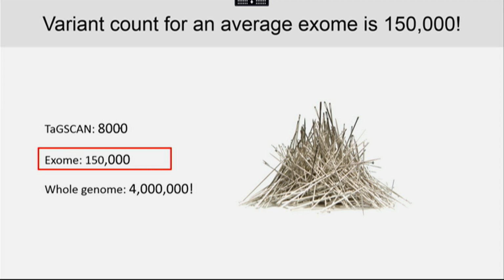If you're fortunate to get parental samples, that helps a lot with the analysis. I was going through our database trying to pick a couple of trios to walk you through how to look at a trio. By and large, almost all of our diagnostic cases are private de novo variants, which are super quick and easy to find.